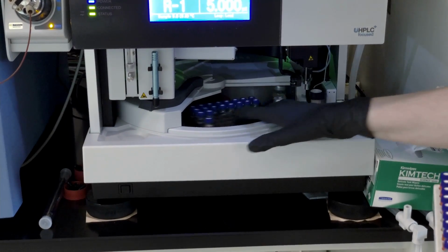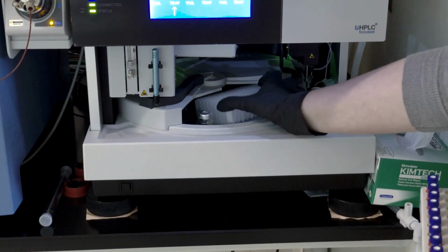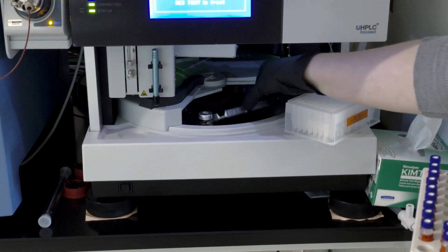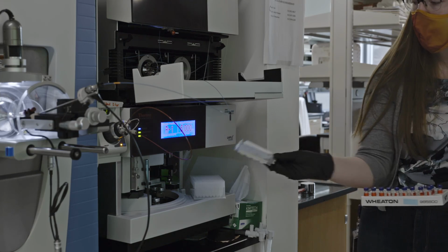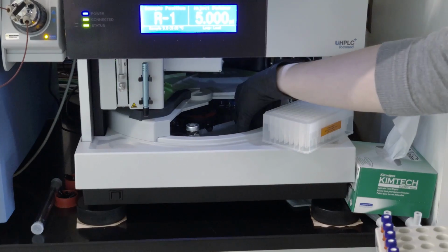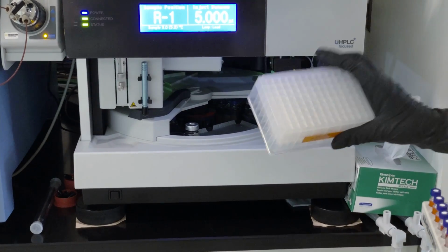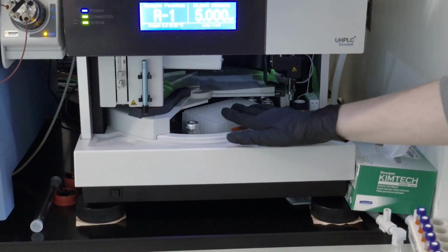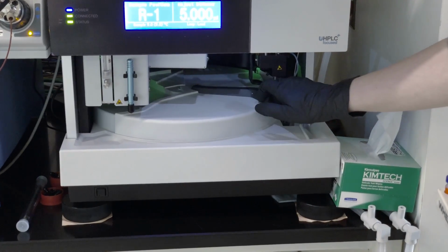If you're using 96 well plates, like this one here, there is a well plate insert that goes into the autosampler before your plate. That looks like this, and sets here to ensure your plate stays in the correct location. Position A1 of your 96 well plate should be in the back left. Once you've added your samples to the autosampler, you just go ahead and close this door again.